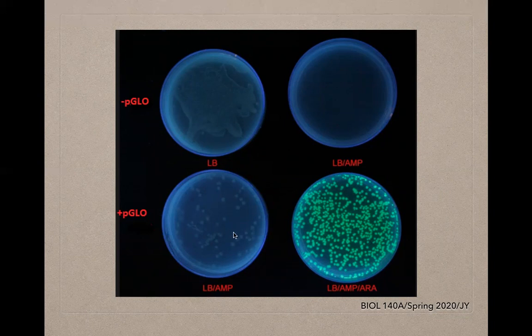On the final plate, you have bacterial growth in the presence of ampicillin, and also fluorescence. This is due to the araC protein being expressed, which activates GFP — green fluorescent protein. GFP is active here and fluoresces as a green color under ultraviolet light.